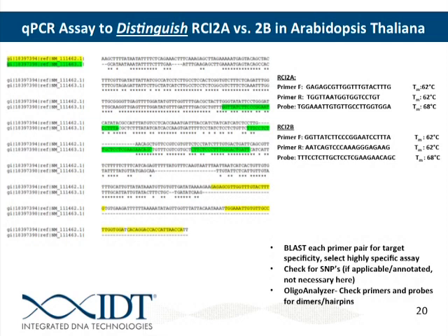I guess first to point out, you notice since we targeted the probe to such a small region, each of these different assays gives us the same probe. It's varying the primer. You'll see that it's assay dependent, but we only gave it a few 30 bases to work with or so. And so all of these have the same probe. So we want to check the first of these assays. Here's the first assay.